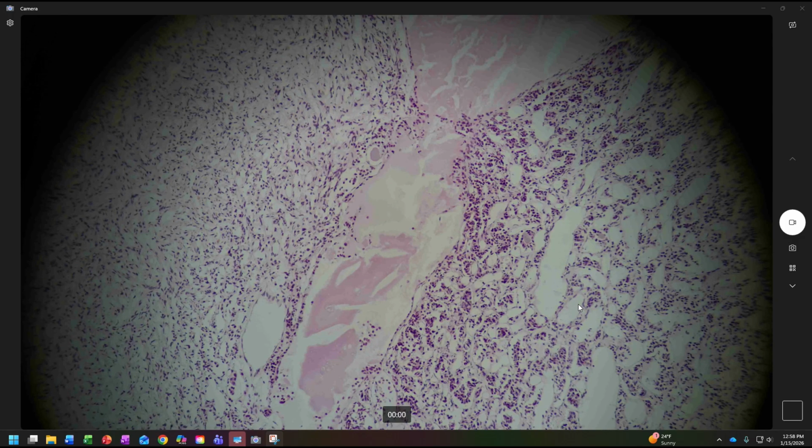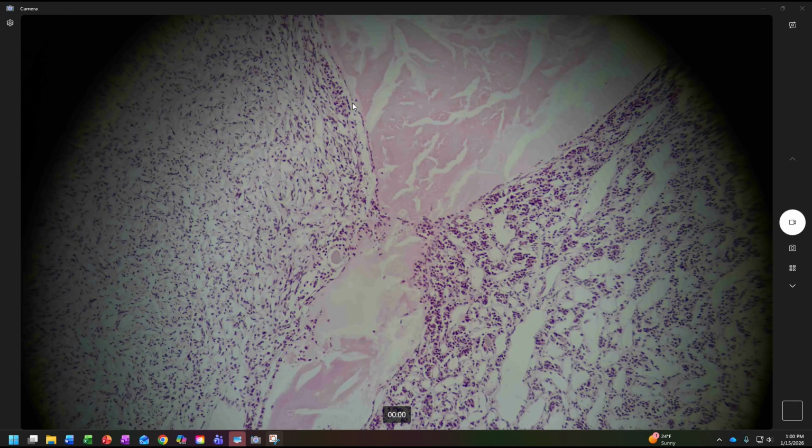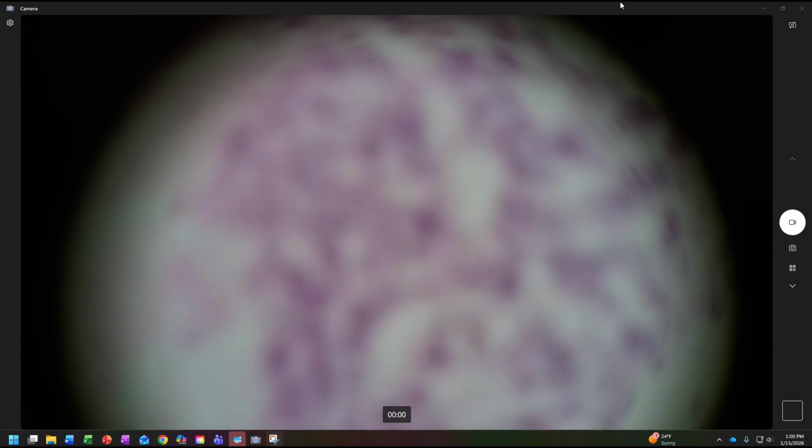So I'm going to look to see if I can find one more, maybe a couple more, another slide. Again, I just want to galvanize what we're looking at, and I'll be back. So give me just a second. Before I do that, sorry, I want to look at the 400x view. This is not anything I would necessarily show on an exam, but I just want to look at it for funsies.